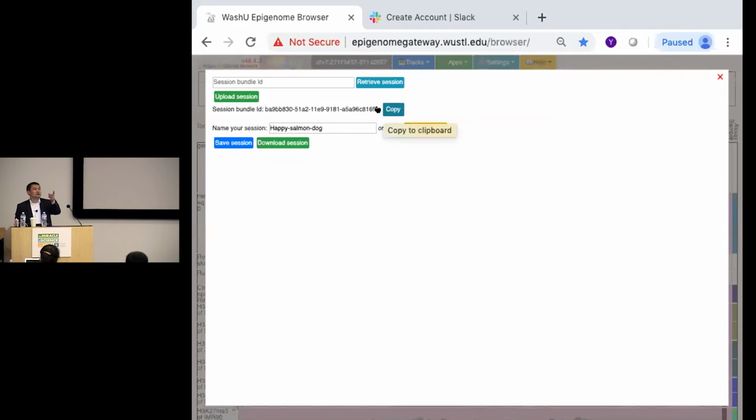Is there a question? Yes, from the TGent. They ask, can they export data in tracks from current visible region in browser as a table of value? If so, how to export those data and what would be the format?